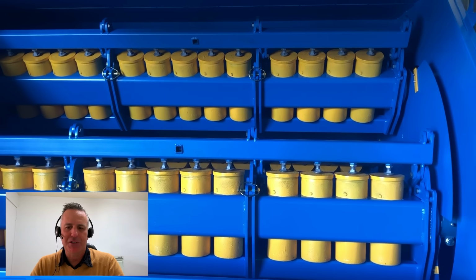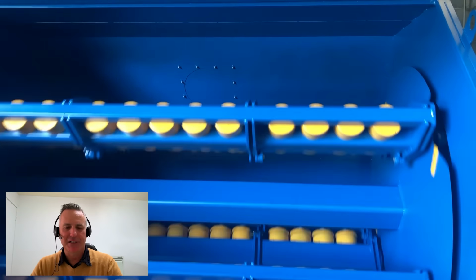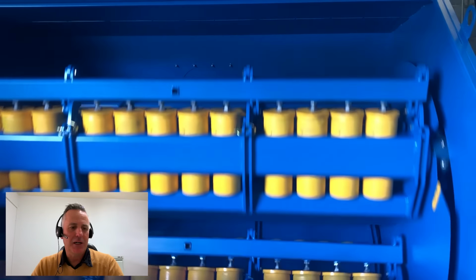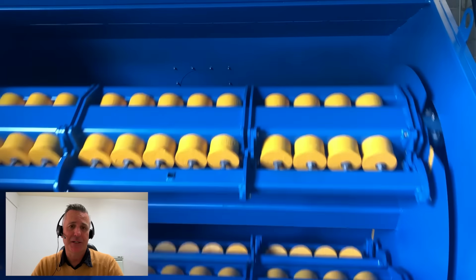So they will take those samples, which are quite coarse. You will then split them down to 1 kilo, and if you've got the image up of the machine, it's got the 52 pots, which you literally just hand feed. So you'll hand feed a kilogram of quite coarse, 2 millimeter material into the machine, seal it all up, and rotate for an hour, generally an hour, and you'll get a very fine material. Generally it's 90% plus passing 75 micron, which is very fine.